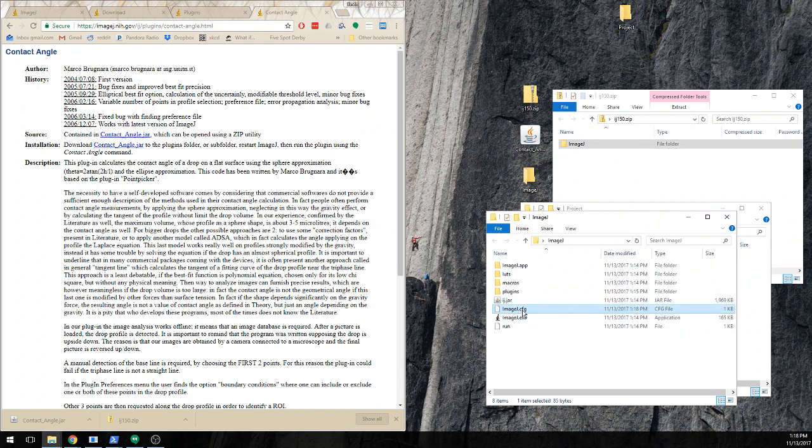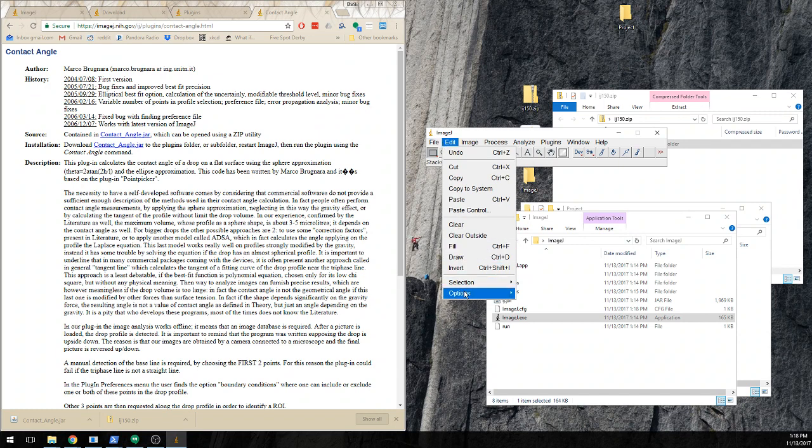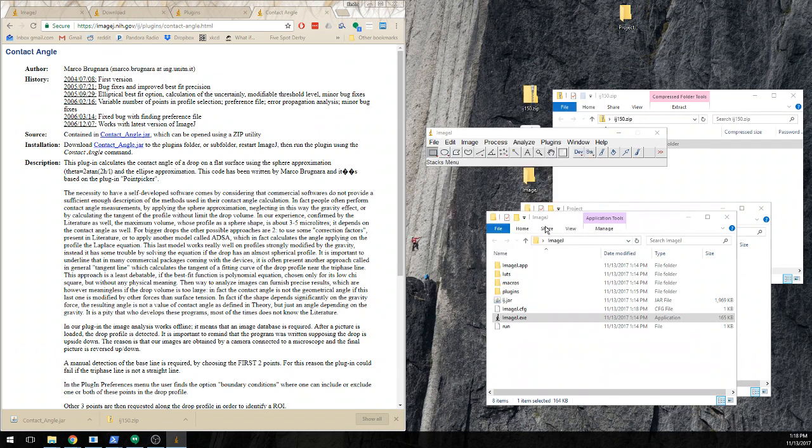Close that, and you see the CFG files right there. You can open up that ImageJ. Let's see, it looks like we can double check and see that the memory was properly configured. And yeah, it comes up and says we got 4 gigabytes. Everything looks good. If we click here on the tooltip bar, it says 4 gigabytes are available. So we're good to go there.